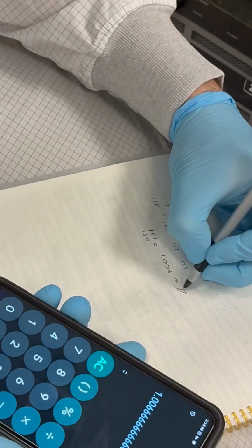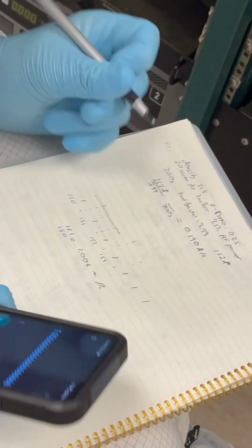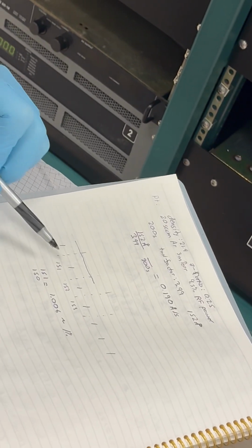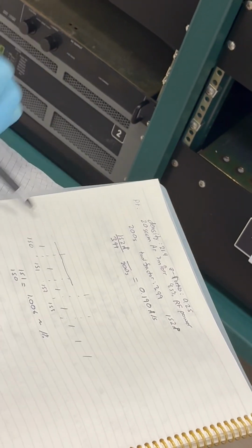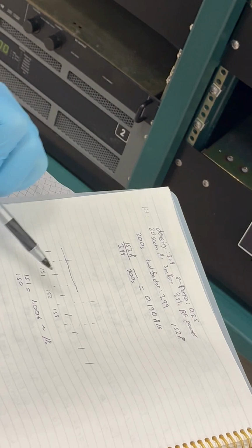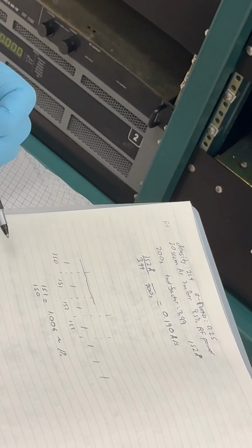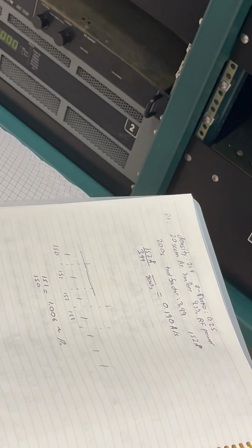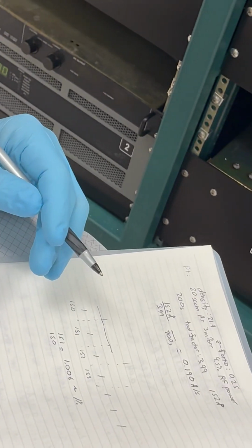About 1%, right? So the error we're getting, because we can't tell you 150.5, we can only tell you 150 or 151. The error you can get is about 1% from that. Regardless of the accuracy of a QCM, which is much more accurate than this, okay?